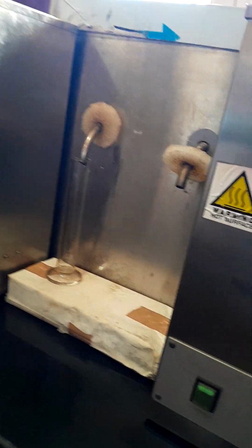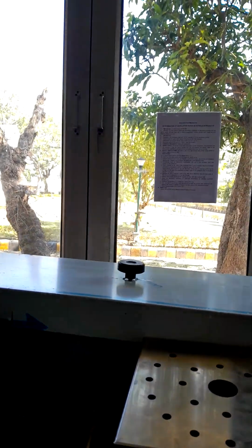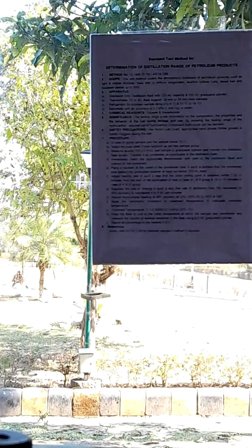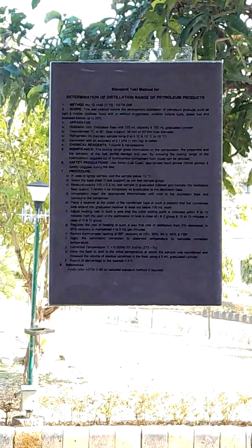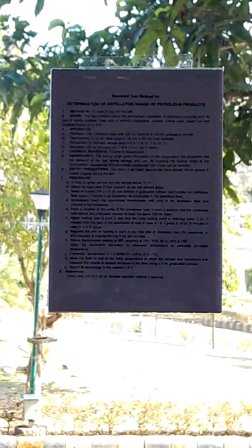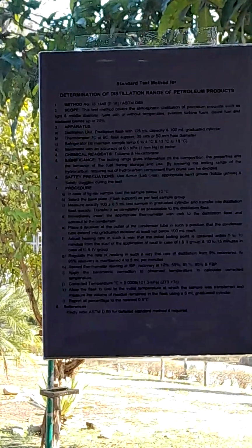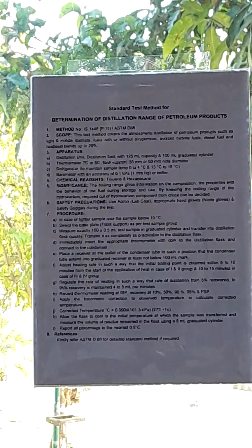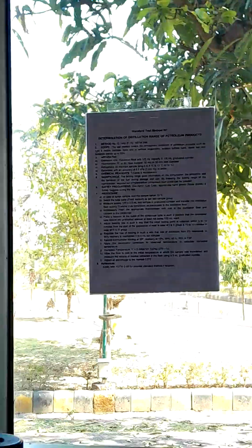So is it proportional or inversely proportional? Not directly. This is just my experience. There is a relation, and there is also my paper. You only give me the D86 data, and I can tell you by calculation what will be the flash point of the particular sample.